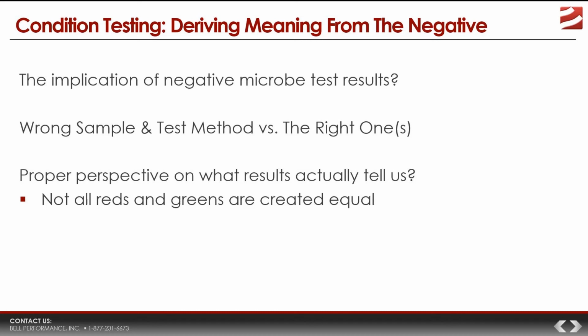And the colors used are intended to imply if contamination is moderate or if it's serious enough to warrant a specific kind of action. However, in the interest of trying to understand what the test is really telling us, this is only a total microbe count that we're getting here.